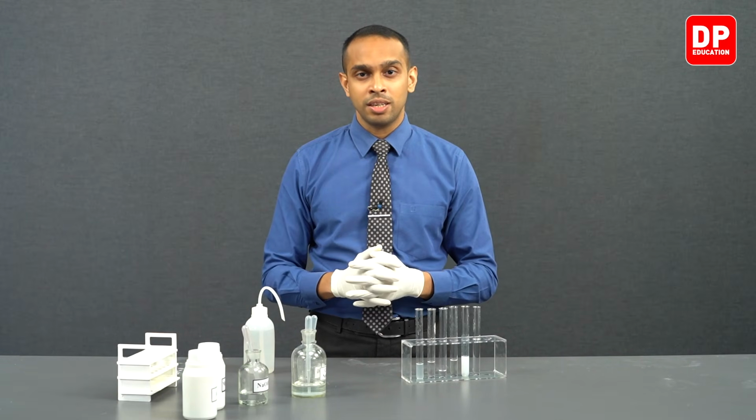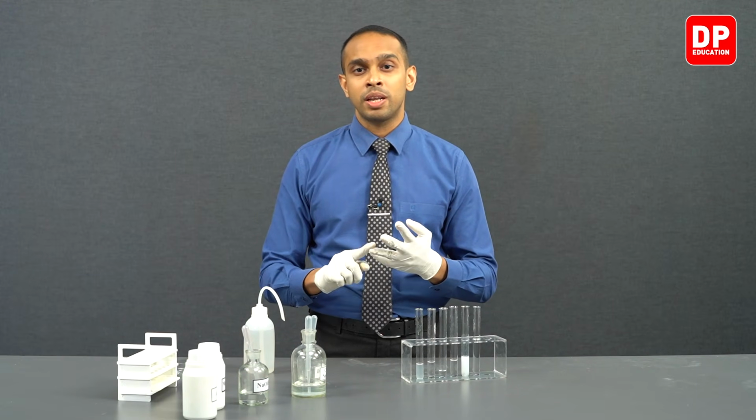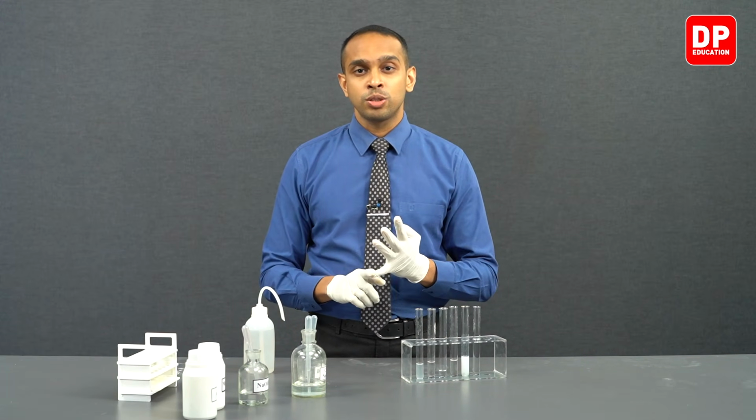Aluminium hydroxide will dissolve in excess sodium hydroxide to form sodium aluminate. It will also dissolve in HCl. Apart from that, zinc hydroxide will also dissolve in excess sodium hydroxide as well as HCl. In excess sodium hydroxide, it will form sodium zincate. Apart from that, we observed how magnesium hydroxide is only reacting with the acids and not with excess sodium hydroxide.